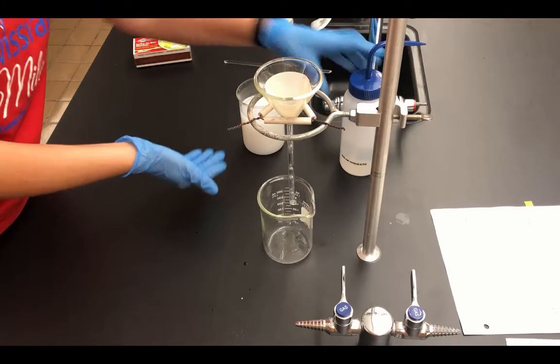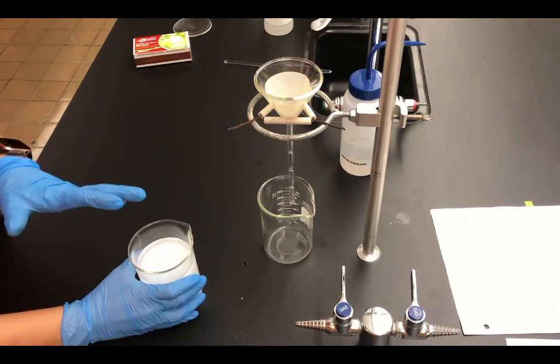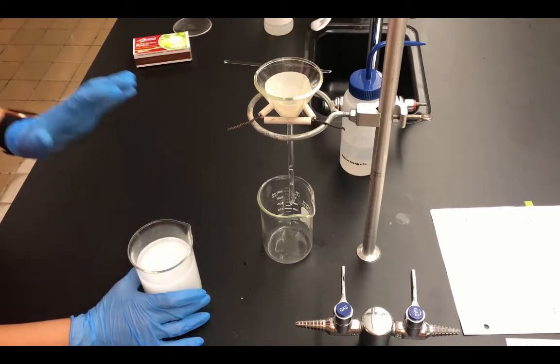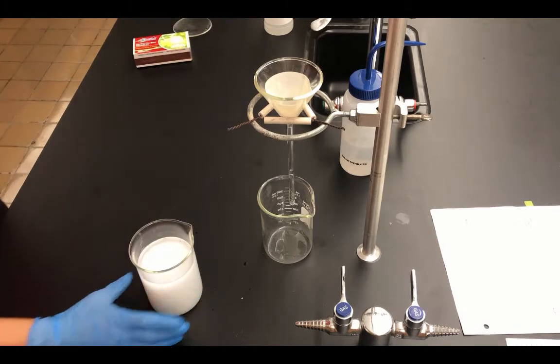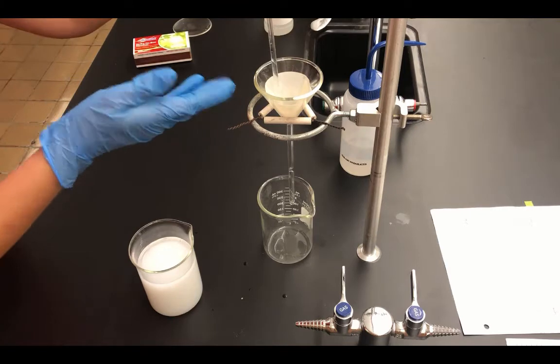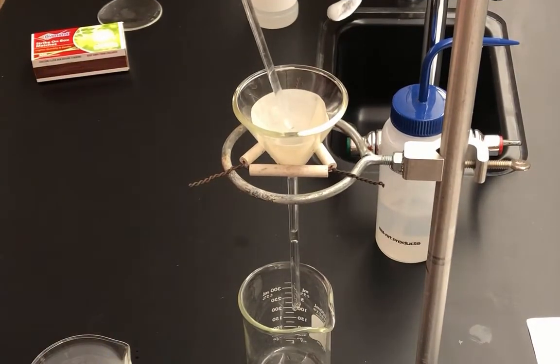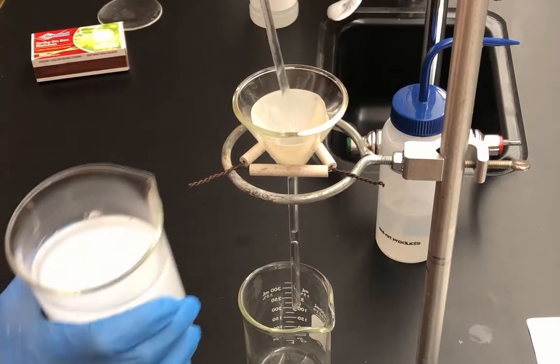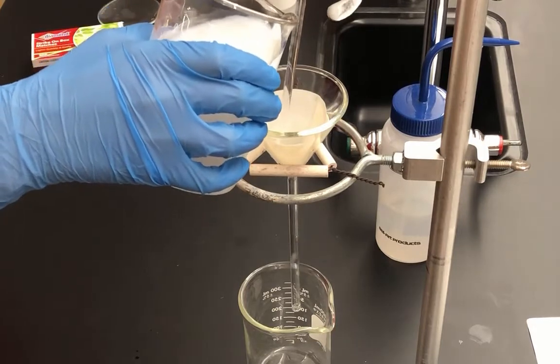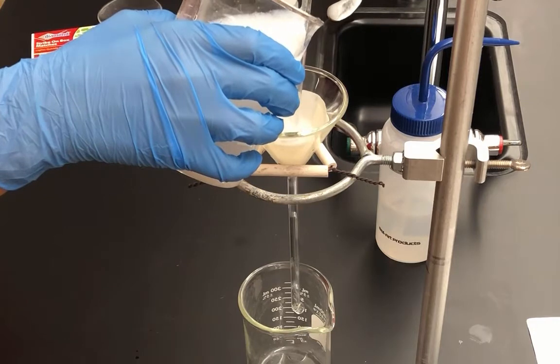So once our precipitate has settled, we're going to go ahead and filter. To filter, we always want to use a stirring rod. Now you want to be careful that you're not pressing too hard into the paper, because you don't want to poke a hole. If you poke a hole, you're going to have to do it all over again. And so we're going to take the edge of the beaker, the lip of the beaker, and pour down the stirring rod.